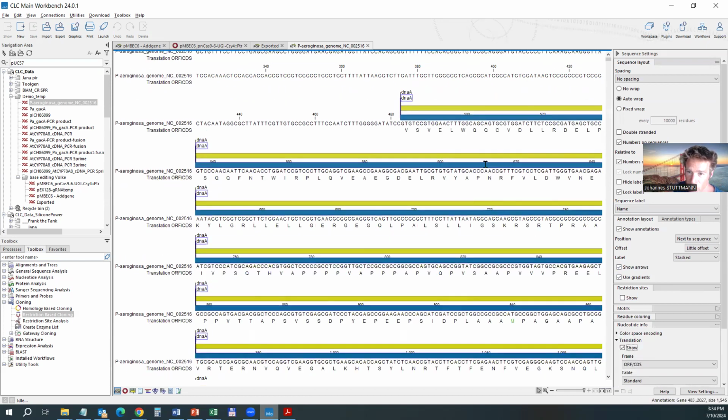But what we can do is look for Q codons. These are the easiest to find. CAG, here we have one, and then see if we have a PAM sequence for Cas9 on the right-hand side. Here we have 2 Q codons. I mean, we have a PAM here, but this is way too close, and then there is none. So at least with a classical Cas9, this would not be possible.